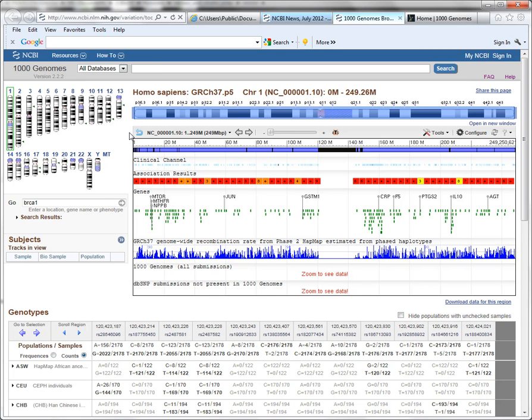So, here is the genome overview widget, and it shows you all of the human chromosomes, and you'll notice this green box here. That's because we are viewing the entire chromosome 1, and so it has a green box around it.